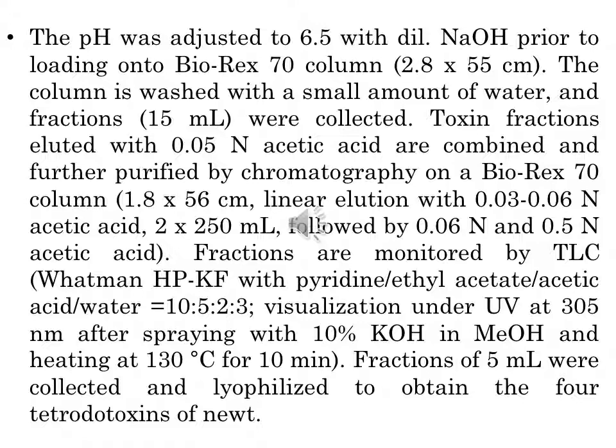This is the step in which organic chemists may simply give up their efforts, since most of them are used to removing inorganic salts by simple partition between water-immiscible organic solvents and aqueous solutions.